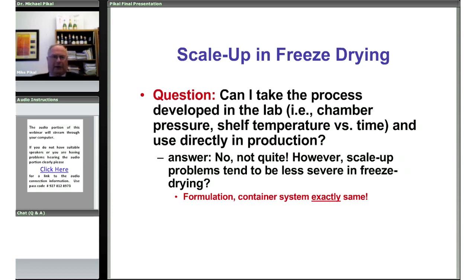if you're fairly careful, the scale-up problems do tend to be less severe in freeze-drying than in many other unit processes, and that's largely because the primary container system, the formulation, the fill volume, all of that is exactly the same from the laboratory into manufacturing.